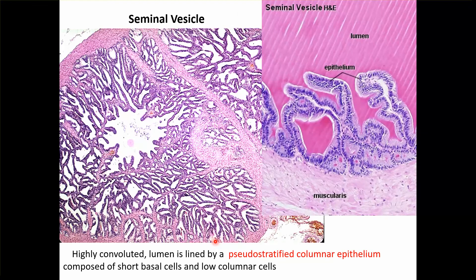Coming to seminal vesicle. It is a highly coiled structure. The lumen is lined with pseudostratified columnar epithelium composed of short basal cells and low columnar cells — the same epithelium as we saw in vas deferens.